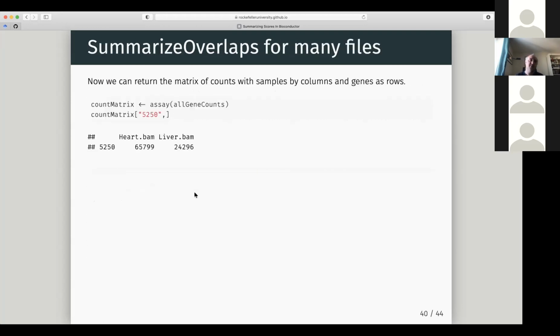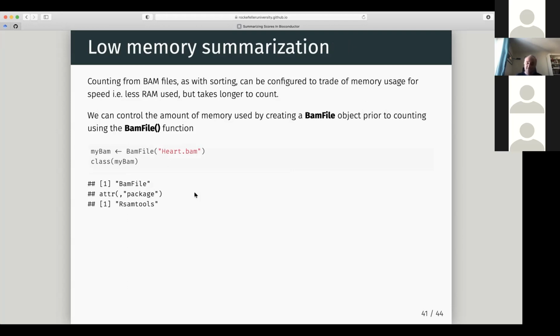Great. So as with every one of these lectures we've done over the Bioconductor a few days, there's always this worry about memory. Right? I am running out of memory often if I'm doing it on my computer. If I'm on a nice bigger computer, if I'm online or AWS or something, maybe I can give myself more memory.